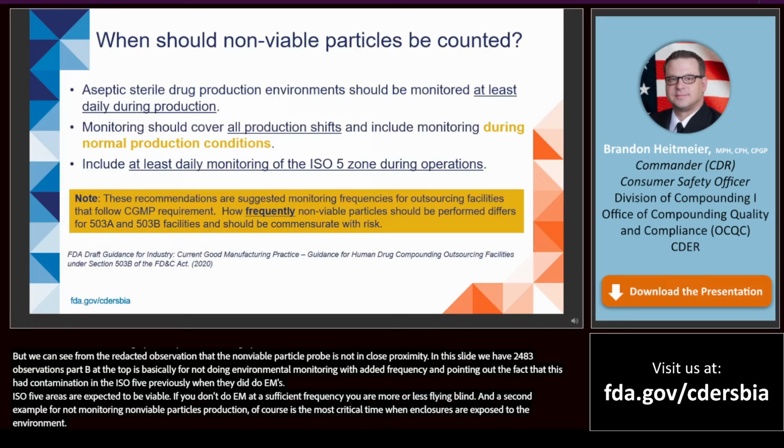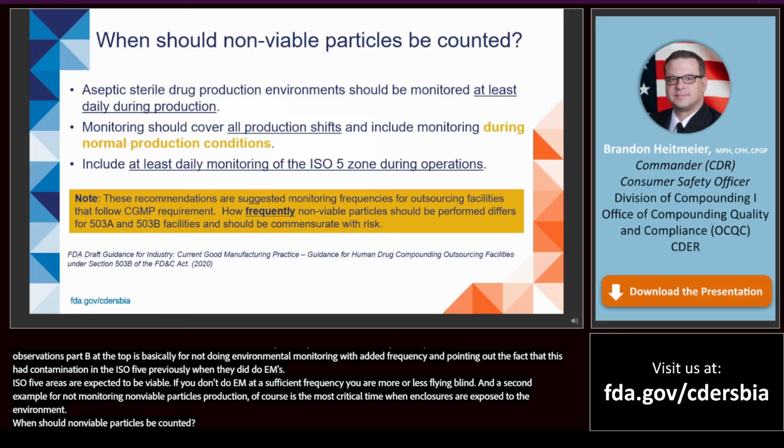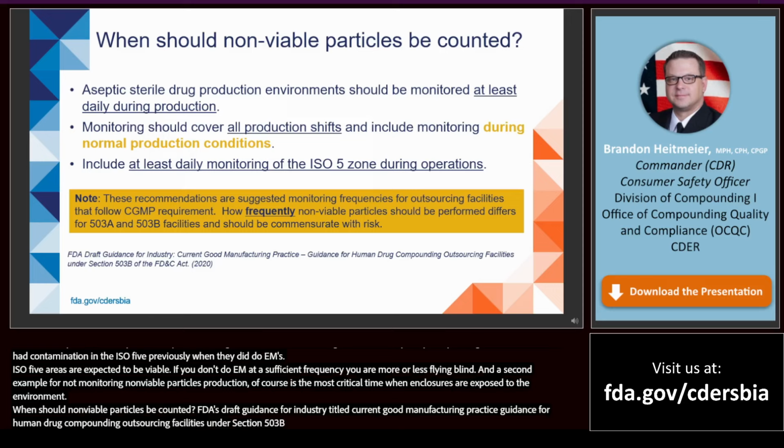When should non-viable particles be counted? FDA's draft guidance for industry titled Current Good Manufacturing Practice Guidance for Human Drug Compounding Outsourcing Facilities under Section 503B of the FD&C Act provides some recommendations for this.